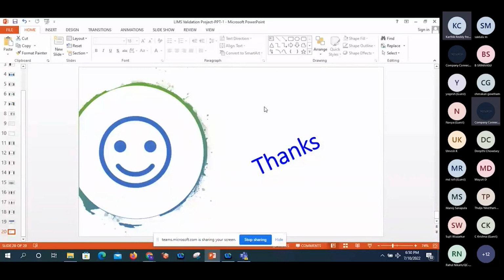Let us say there is raw lot management. Lot management has 5 types, like raw material, in process, finished product, and so on. But in that, we will introduce it initially. We need to do the development testing in the development environment. According to the URS, whether it is intended for internal use or not, we need to test it. Then we move the same thing to the quality environment, test it there, and after that move to the production environment. So module-wise, we can deliver to the end user.